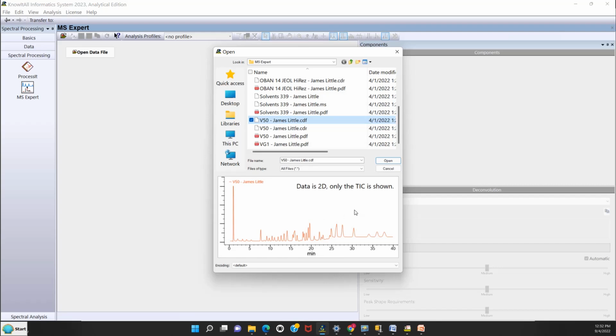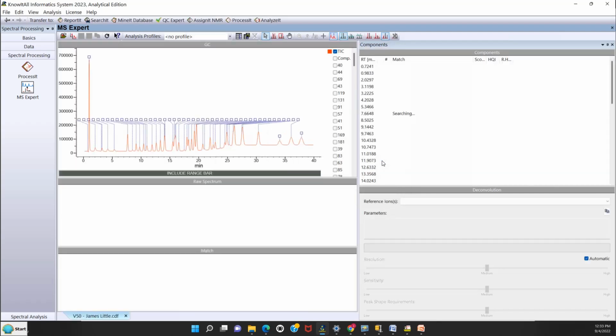You can see the chromatogram that is one that we processed manually, but now when we open it, it'll take out all of the background here. And if any compounds are not well separated, looks like there's a shoulder here, it'll automatically separate those components via the program and get good results for the mixtures. So let's open the file.